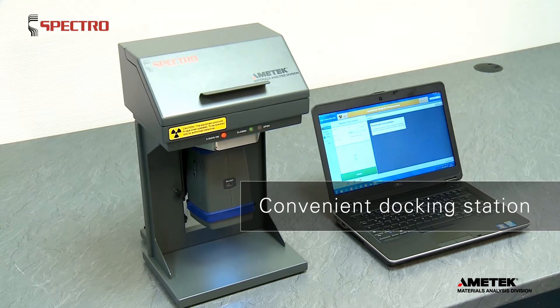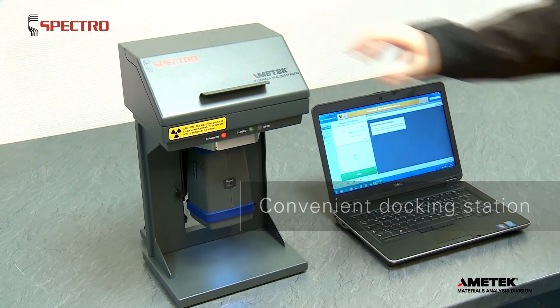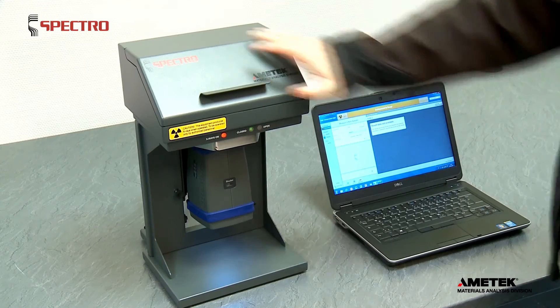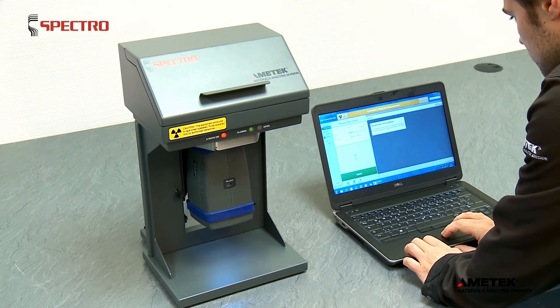This XSort combi model is set up to be used with its optional docking station and operated via laptop. The docking station is used for small parts and especially for all non-metallic objects.